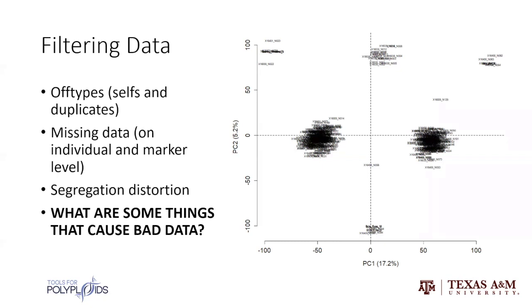That's very helpful. But when you say that segregation distortion is not factored in this program, you are saying for this particular tool which you are using? Because I think like JoinMap, these tools can take these kind of markers, but I am not so sure. When you say this is not included, is this for any linkage mapping software or just for the one you are giving the tutorial for?